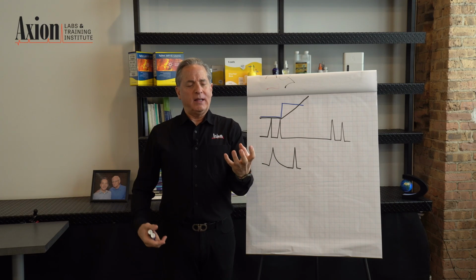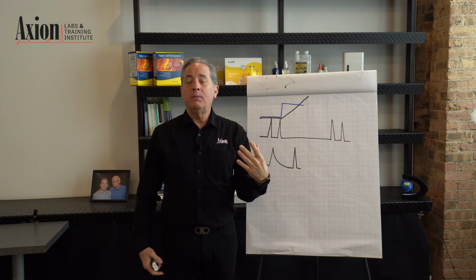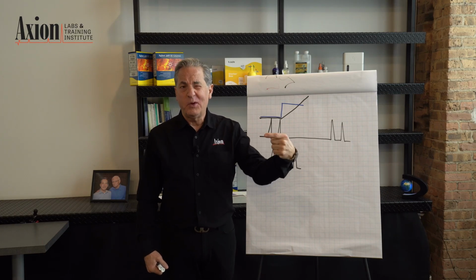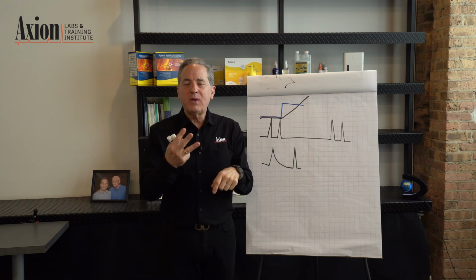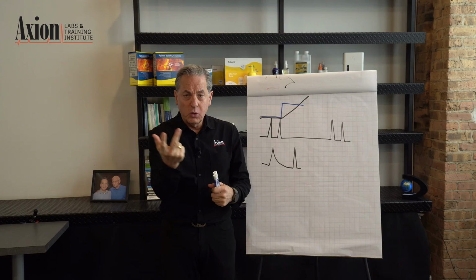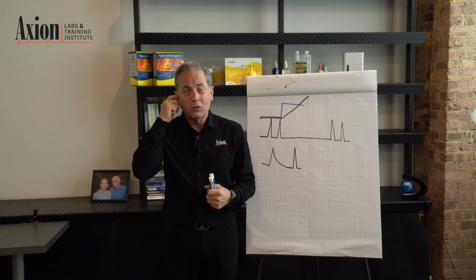Okay, wow. So the total flow, so we're talking GC. If you look at the inlet, we could measure what's called total flow. Total flow coming in, we really measure coming in, it's really three things going out. It's the column flow plus the split flow plus the septum purge. Right? Those three things add up to total flow.